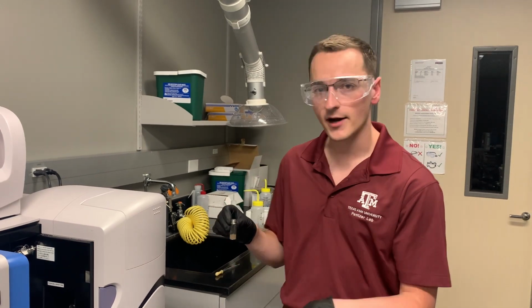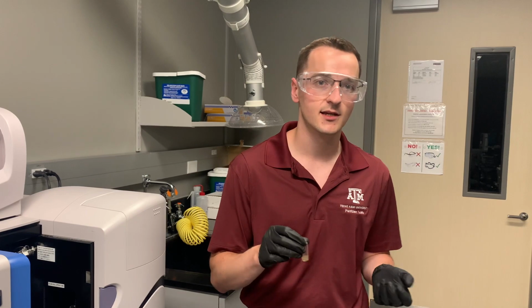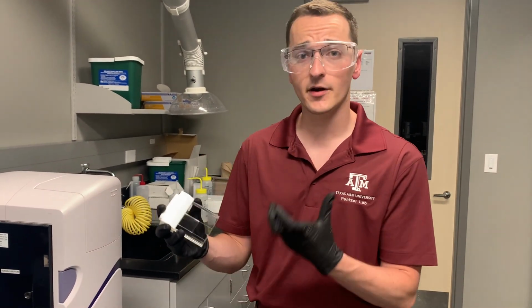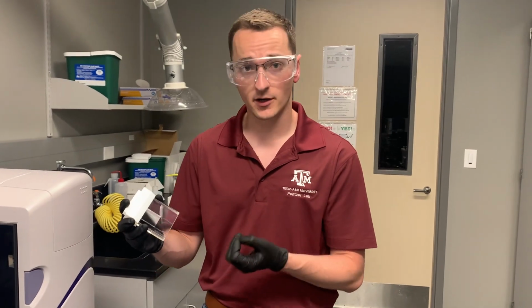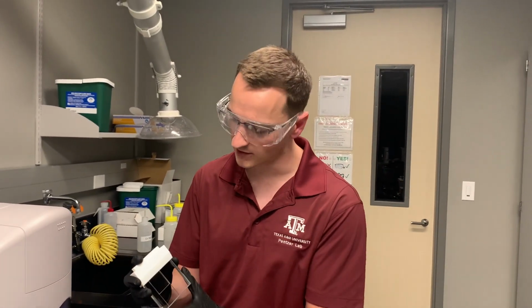And now we'll use the fraction cell method to obtain a much more precise particle size distribution. I've removed the fraction cell from the instrument, and the first thing you're going to want to make sure of is that the interior and the exterior of the cell are clean. The last user should have flushed the window with isopropanol just to make sure that any residual impurities have been completely removed from the system.